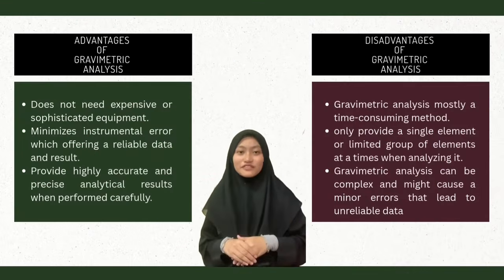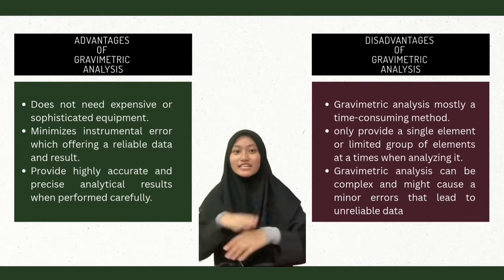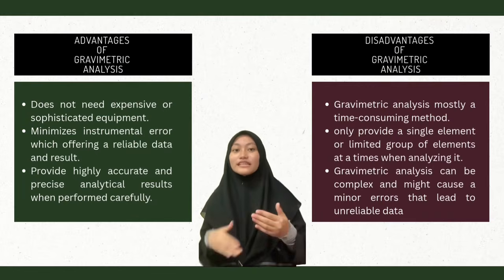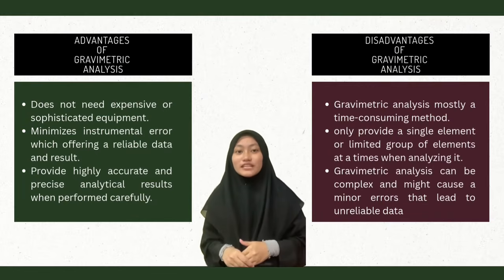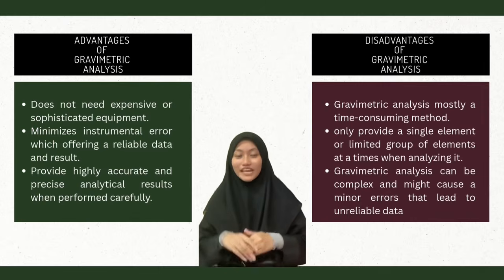Let's talk about the advantages of gravimetric analysis. First, gravimetric analysis does not need expensive or sophisticated equipment. Second, it can minimize instrumental error, which offers reliable data and results. Lastly, it provides highly accurate and precise analytical results when performed carefully.